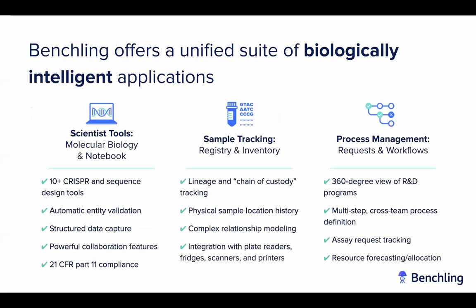So for those of you who don't know, Benchling has a suite of biologically intelligent applications. We have a molecular biology tool, which we're going to dig into in great detail today, that allows you to do DNA and protein design, as well as a notebook that allows you to capture protocols and record data and results for your experiments.